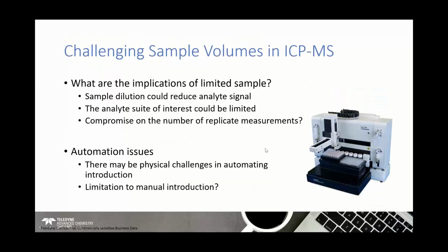So what are the implications of this? A good place to start would be something like, if you had a low amount of physical sample available, and the analyte or analytes that you're interested in are present at a low concentration, then for you to do a digest on something, or a dilution, or the first one then the other, that could ultimately end up in a reduction of the available analyte signal that you could get from that sample, and it might not be possible to detect it.